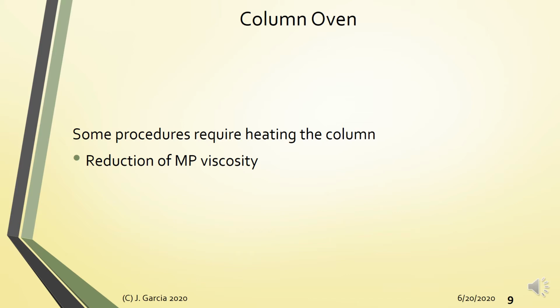Alright, so yung mga columns may nakalagay yan na parang operational back pressure siya, no, na kaya niya i-withstand. So never operate your columns at back pressures higher than what is indicated in the package insert. All right. Now another reason for controlling the temperature of the column is to improve the separation efficiency.